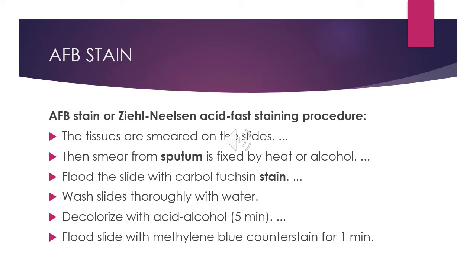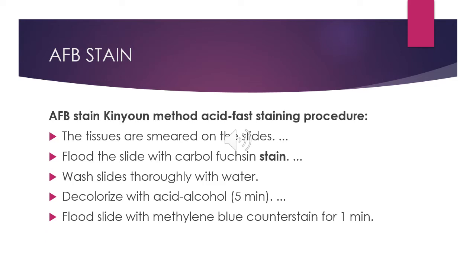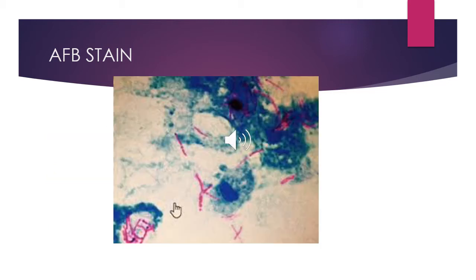While in the Kinyoun method, Kinyoun, cold, this does not apply heat upon addition of the primary carbol fuchsin. However, it prolongs the contact time of the stain with the bacterial smear.